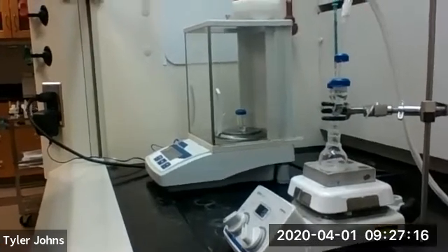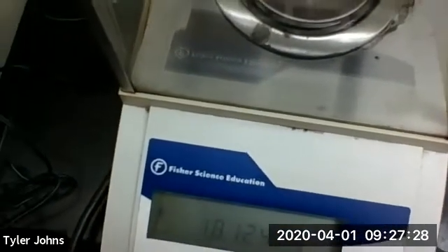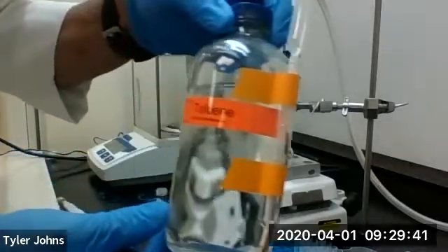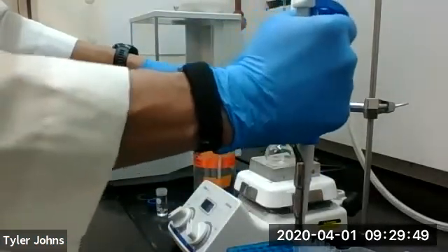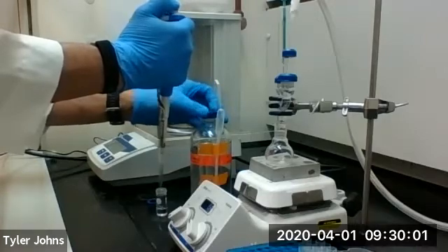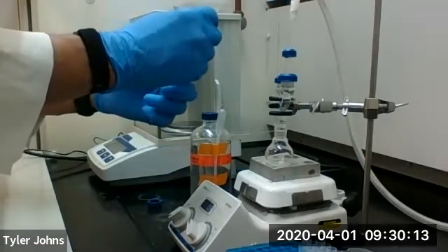As that's mixing, we need to pre-weigh a 3 mL conical vial, which I've done here. Next we're going to add 0.5 milliliters of toluene, our aromatic compound, to our 3 mL conical vial. We're going to use our syringe to add the toluene to our round bottom flask.